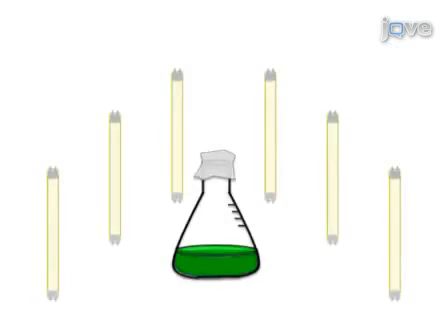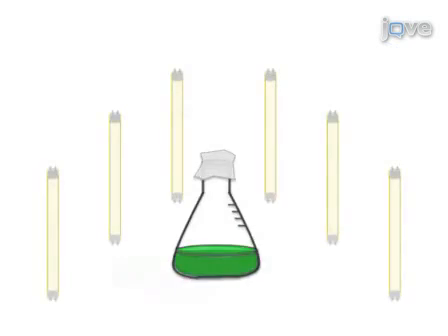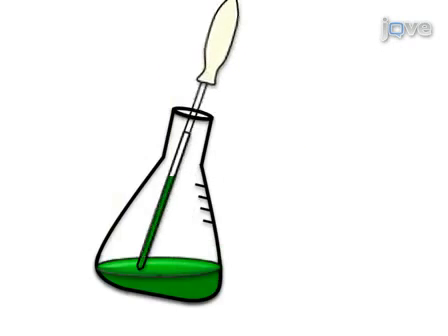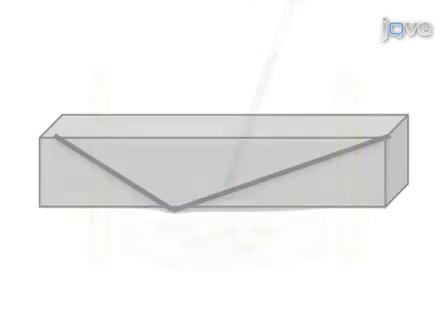The gametes are then combined in a single flask for mating. Samples are spotted on a TAP-Agar plate in light, then wrapped in foil for zygospore maturation.